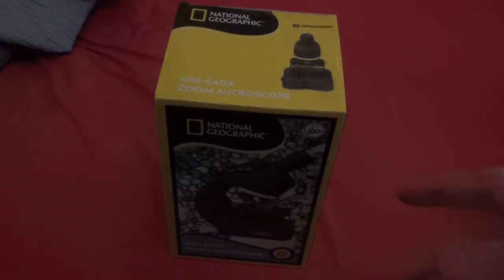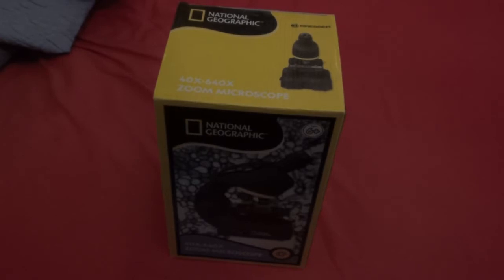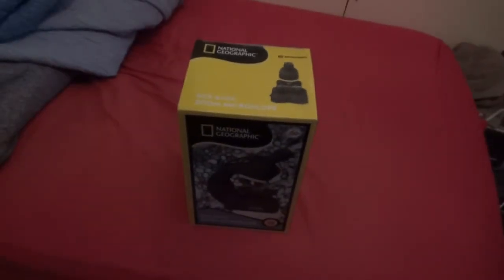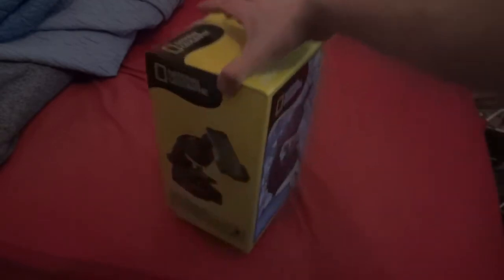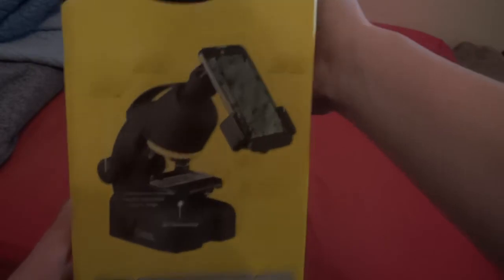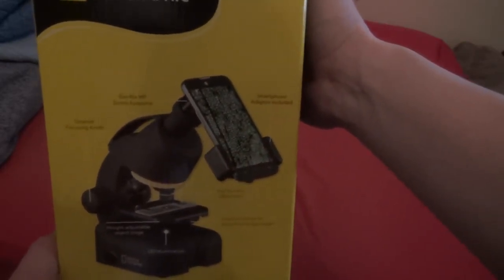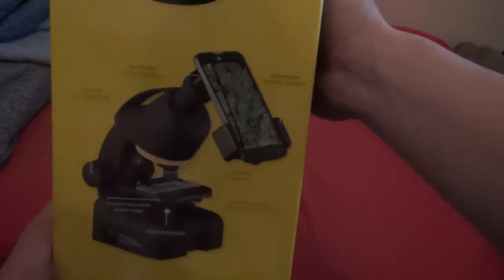It even has a little dock for it as well. So let me just zoom out right here. Here it is with the smartphone on it. Smartphone not included by the way — only the connectors are included.